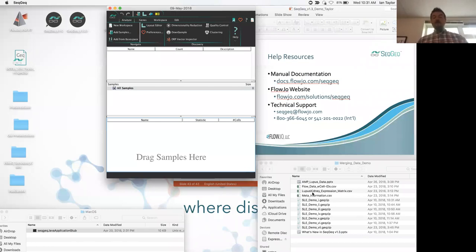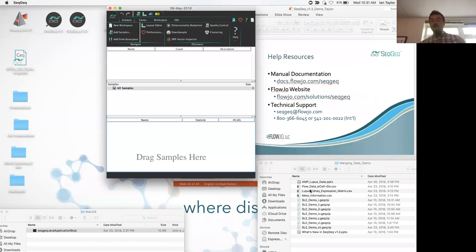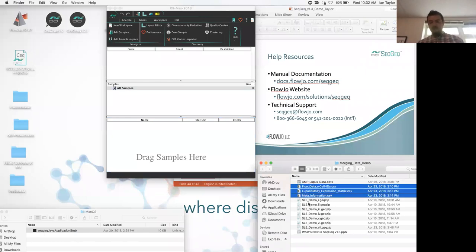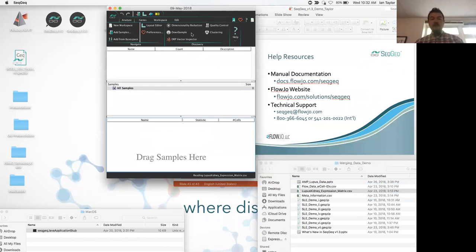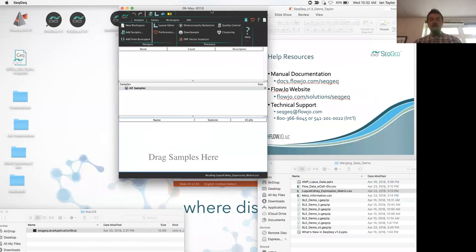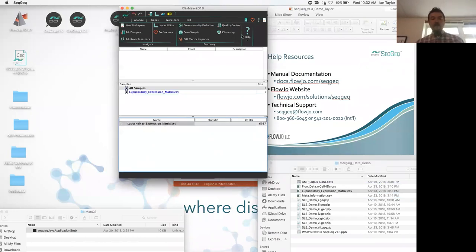When you first download SeatGeek and check out this data, you'll notice everything has already been nicely merged. But this demo shows how you would merge those artifacts yourself if you've done index sorting and have an expression matrix associated with a given set of cells. Starting with the lupus kidney expression matrix, I'll load that into SeatGeek with a drag and drop — it is rather large, so it'll take a little while.